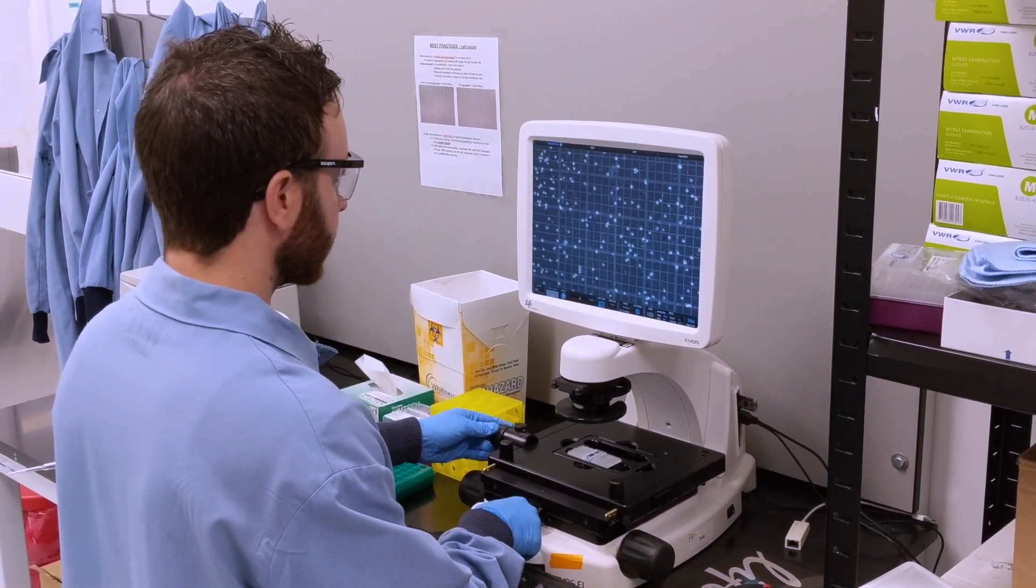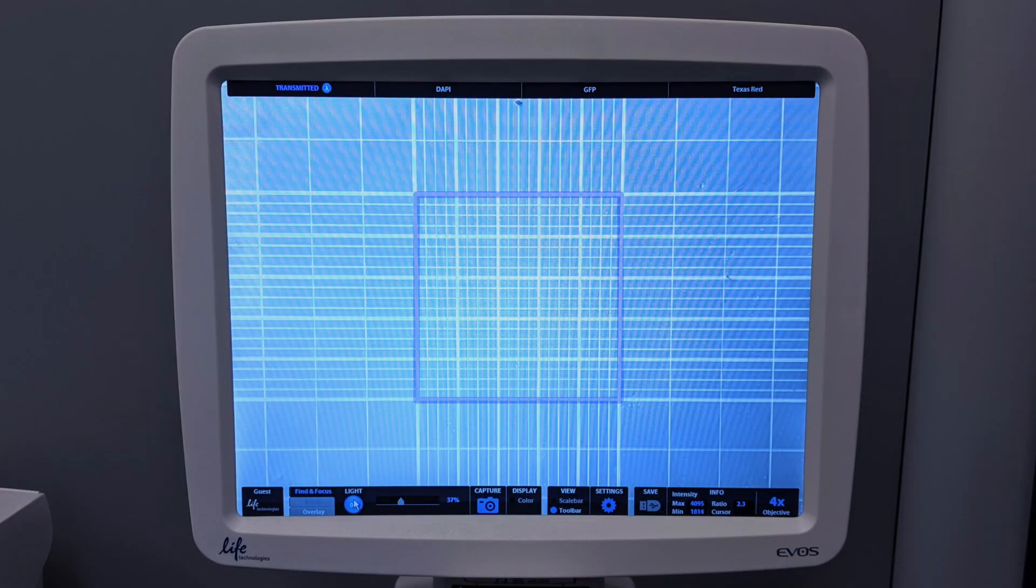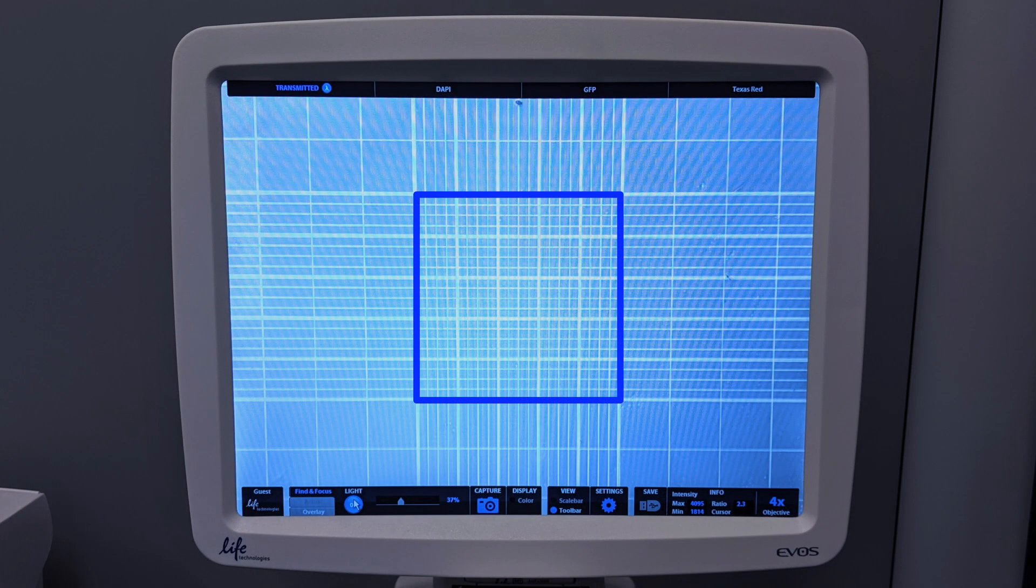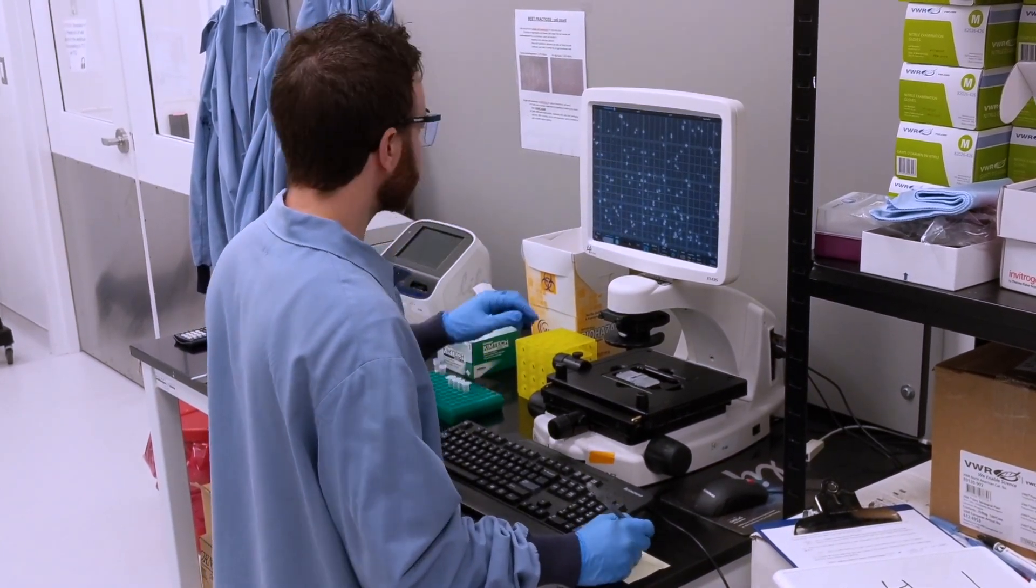To begin counting, choose a square and move the hemocytometer such that all four sides of the square are within your field of view. Now you may begin counting your cells manually or with the help of a counting device.